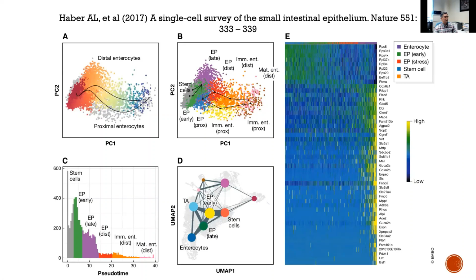This is another study, a study using pseudotime analysis for small intestinal epithelium and differentiation. What they used is different dimension reduction technology, and they use different technology to do this, to reconstruct the trajectory. We will mention how this can be done using a real example.